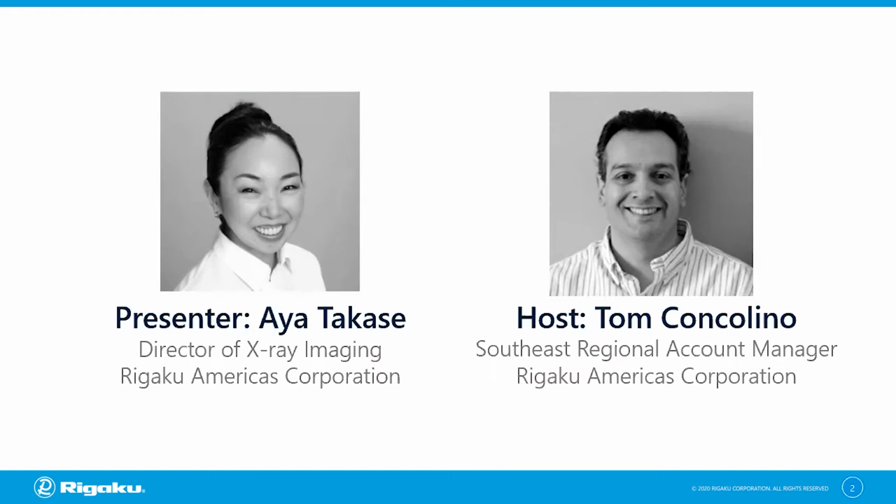It will focus on the principles and techniques researchers use in evaluating materials for industrial applications. We will review industrial metrology and discuss when CT works better than traditional methods, such as CMM, a coordinate measuring machine, which Aya will review. We'll also discuss how to process CT images to obtain accurate dimensional analysis results. Aya will also offer methods for dealing with the unique challenges of performing CT experiments on material science samples.